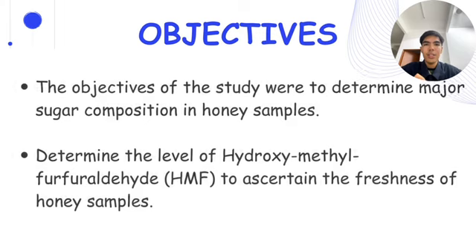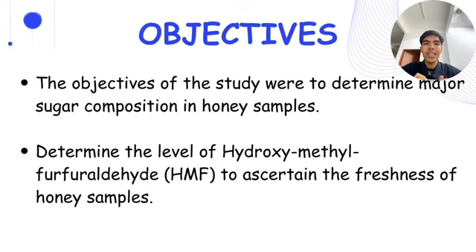So now we are into the objectives. In this study, there are two objectives. Firstly, to determine major sugar composition in the honey samples. Second, to determine the level of hydroxymethylfurfural (HMF) to ascertain the freshness of the honey samples.